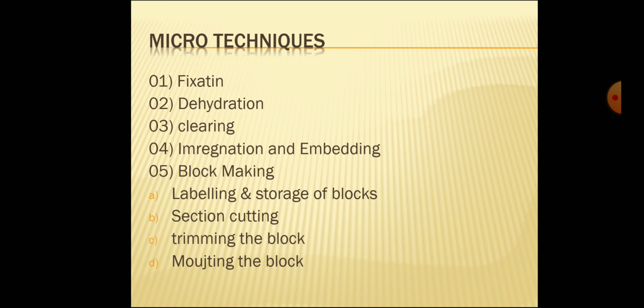So fixatives are used for fixation of all parts of the tissues and to prevent post-mortem changes of the tissues. After that, the fixatives act on the tissues with their color action, which is not useful for the further process, so their removal is necessary.